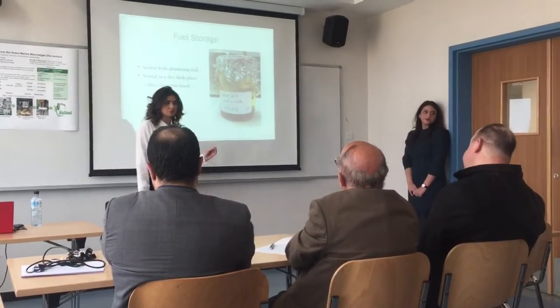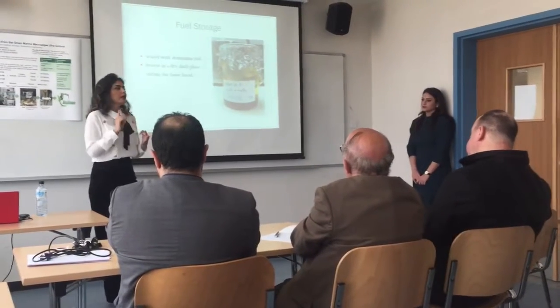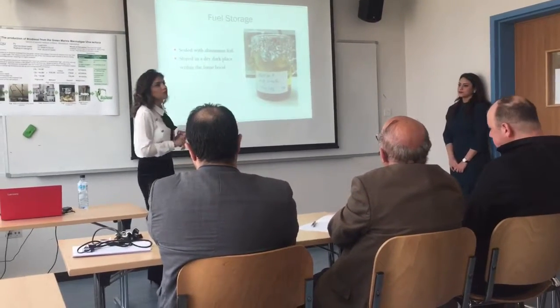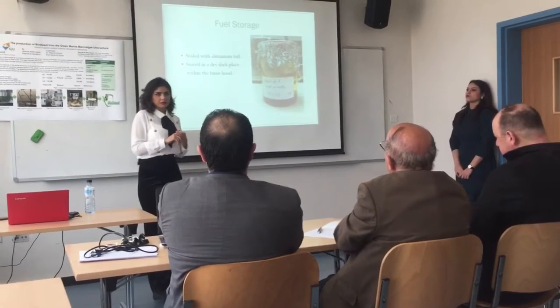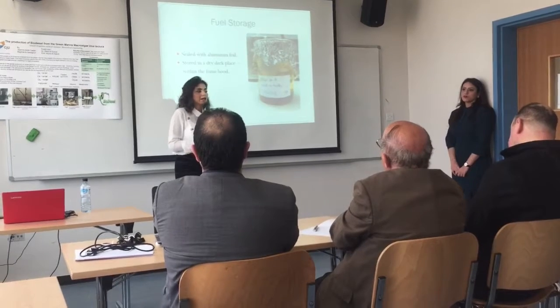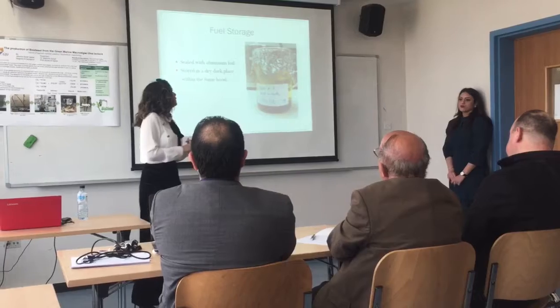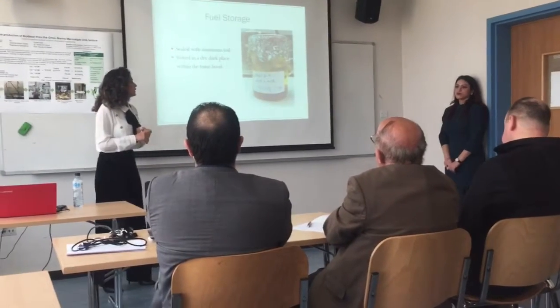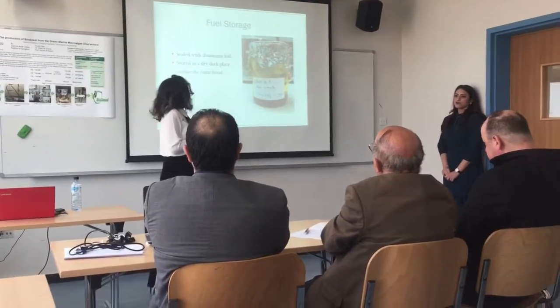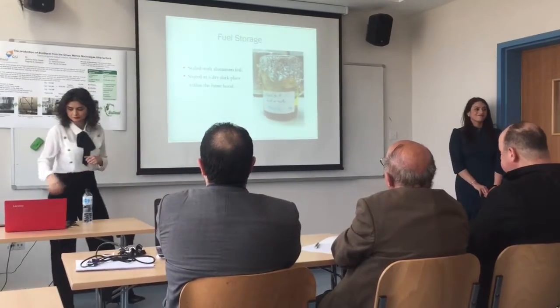Okay, so biodiesel can degrade due to oxidization, contact with water, and microbial activity. And also, it has the tendency to freeze at higher temperatures than the petroleum fuel. So in our case, we stored the sample using sealed aluminum foil, and it was stored in a dry, dark place within the fume hood.